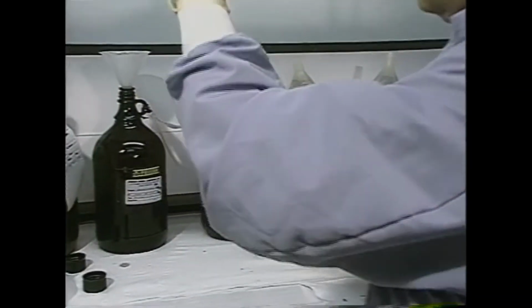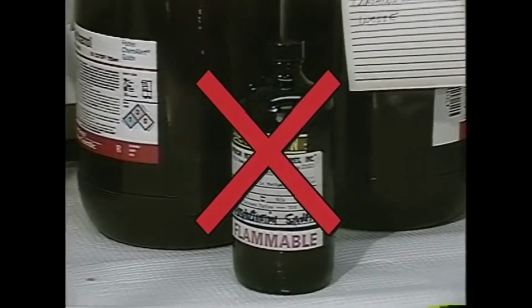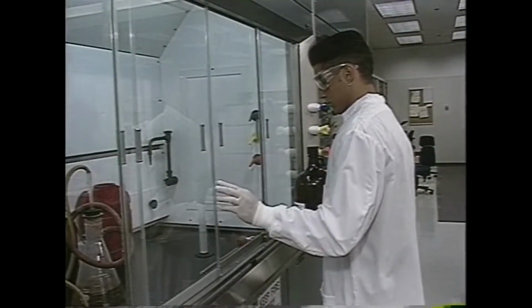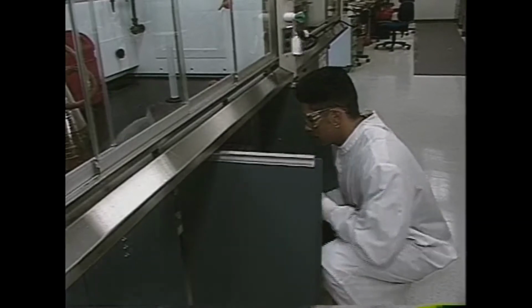Remember that a lab hood is a tool for your protection, not a storage cabinet for materials or equipment. Storing chemicals in a hood can be dangerous, especially if they are flammable or reactive. So always return supplies and glassware to their appropriate storage places.